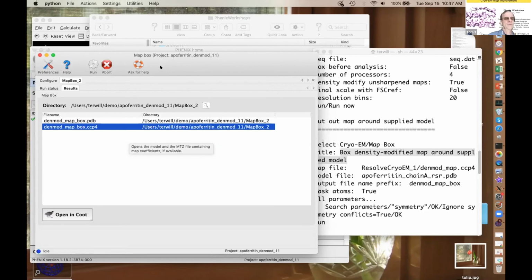And so the default is to use the average best value from a bunch of test cases. So that's what it does for you if you don't tell it anything. If that doesn't work the best, you can change that a little bit less, a little bit more, and you will get a different answer. And that's just a matter of trying it.